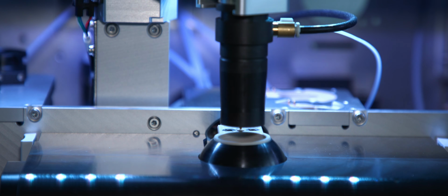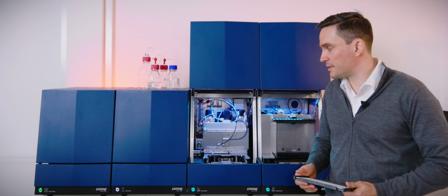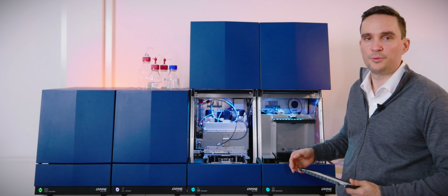These derivatization reagents are often very aggressive. We work with hydrochloric acid and sometimes with reagents that contain sulfuric acid too. So it's important that the entire fluidic path is cleaned very quickly and efficiently.